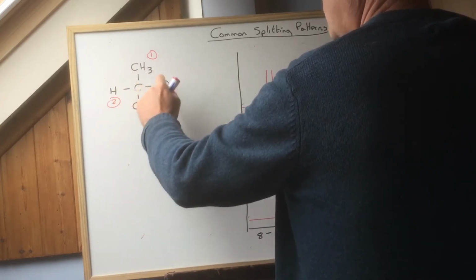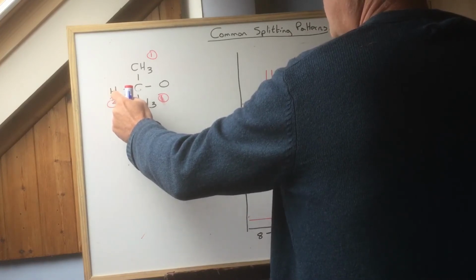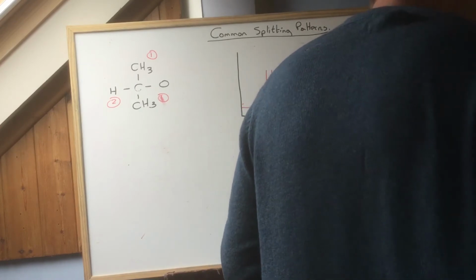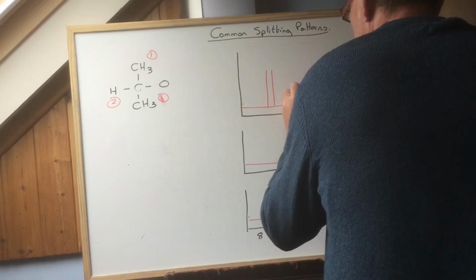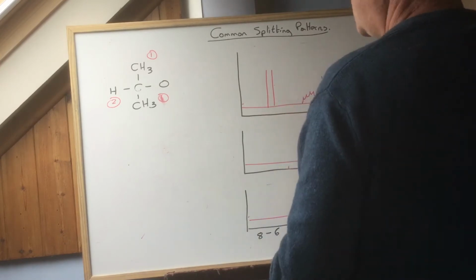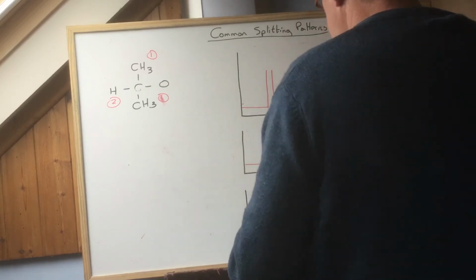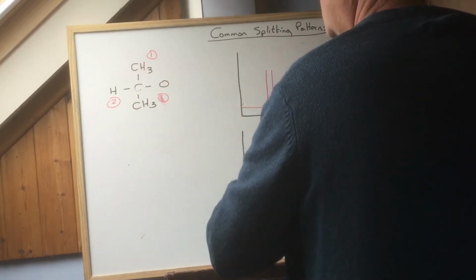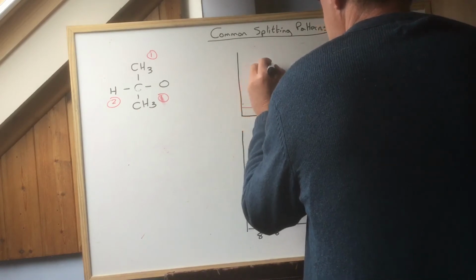So in other words, N plus 1, the peak giving that proton there, 7. So you're going to get a beautiful thing that looks like this. Probably looks a bit like this in the actual spectrum. Then you put the integration on. So there you go, split into a doublet, integration.